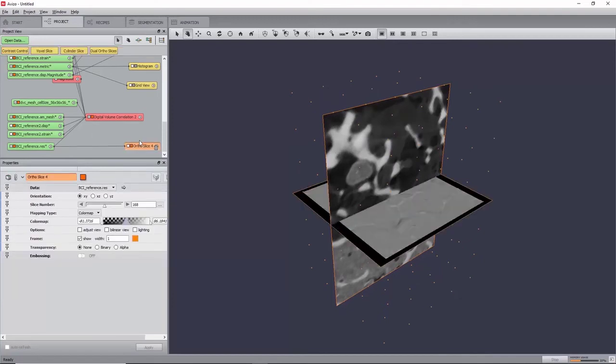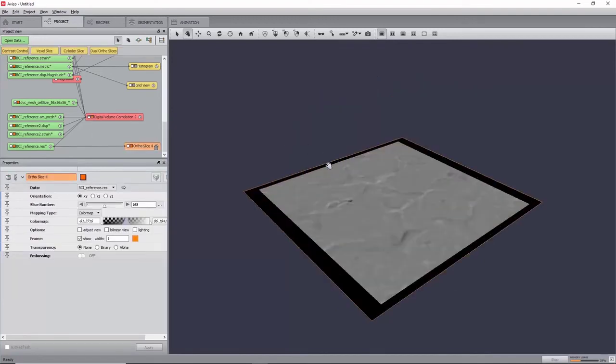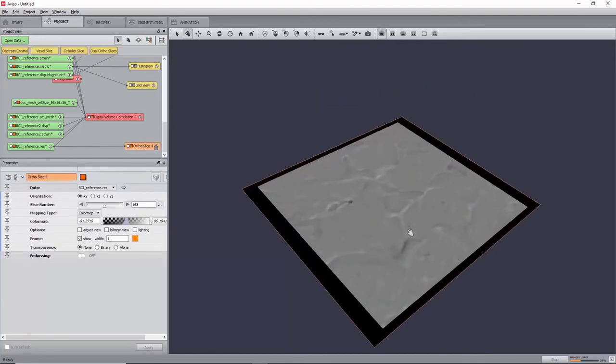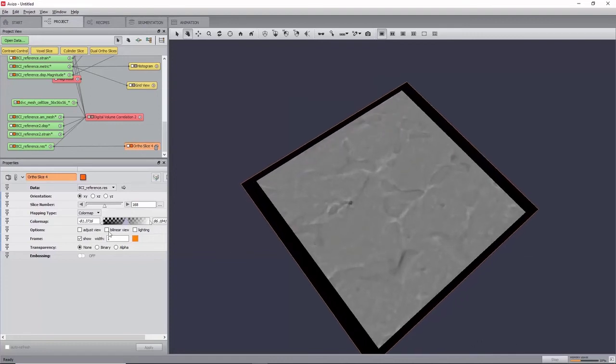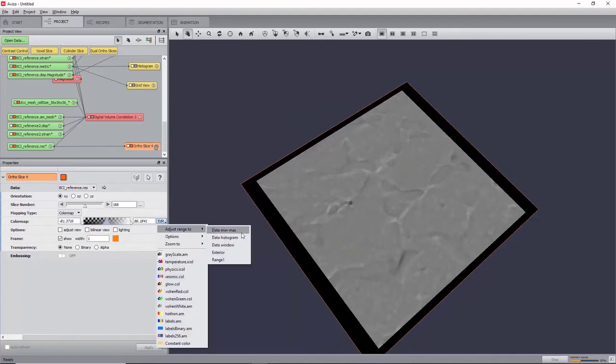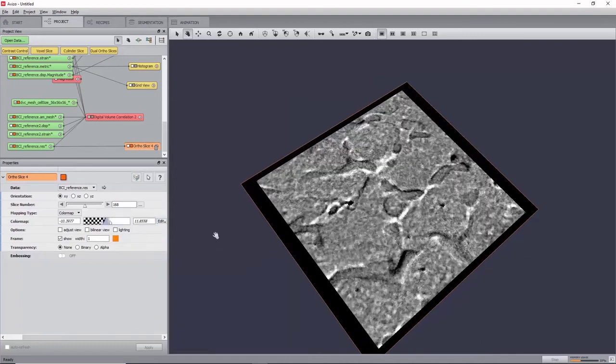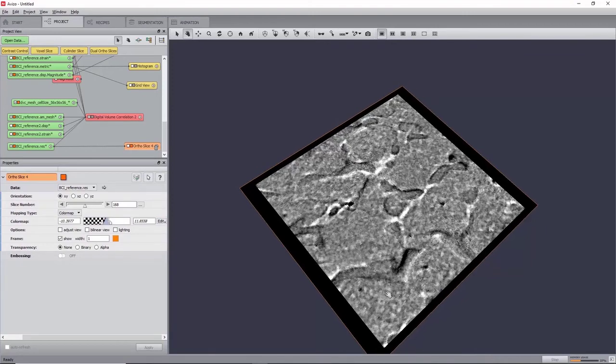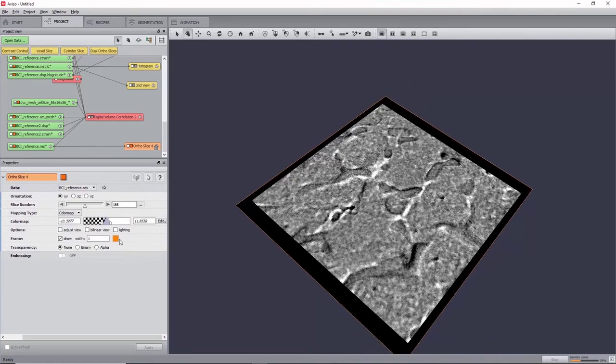And change the color map by clicking Edit Adjust Range to Data Histogram. Good correlation zones will have values close to zero.